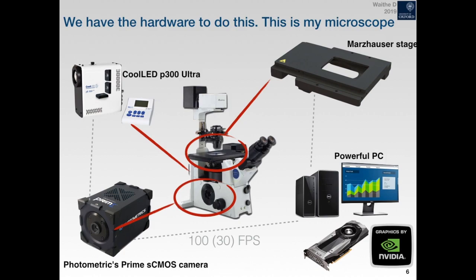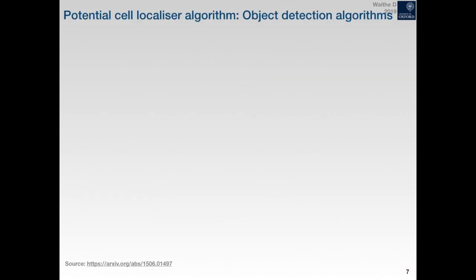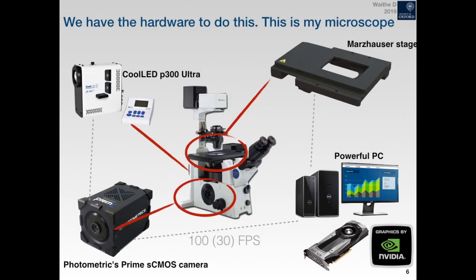So for example, in my institute we have some state-of-the-art microscopes, and they're very custom. It doesn't make sense to try and put a STED microscope on a screening microscope, for example. What we want to do is be able to do screening on a conventional microscope, so we could still do STED on it because it's using conventional components, but we have the ability to do automation as well. So it's about bringing automation to your regular microscopes. That's what will enable people to do it, rather than making a super automated STED microscope from scratch, if you see what I mean, a turnkey system.